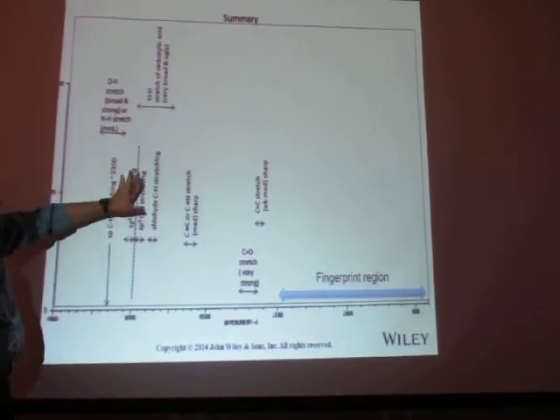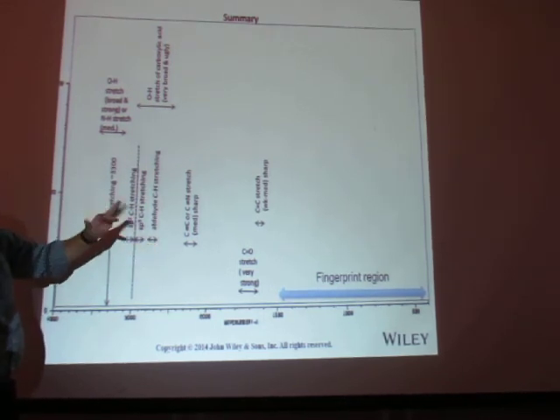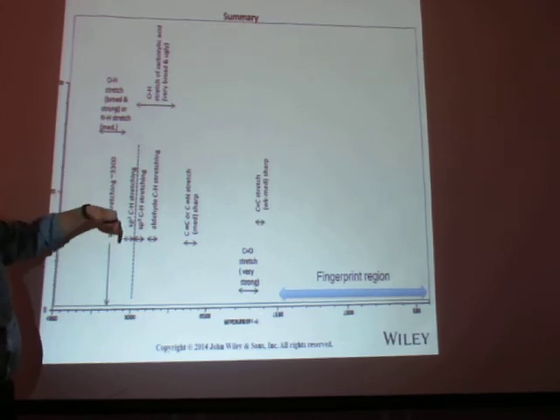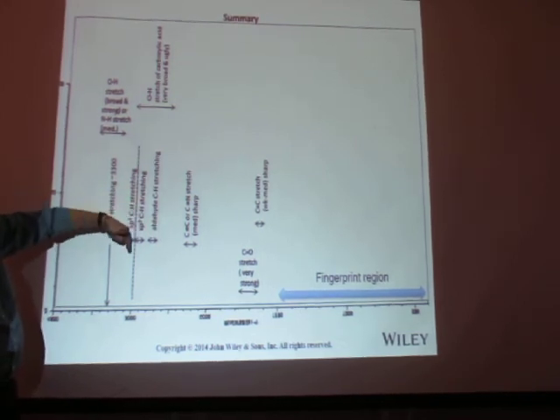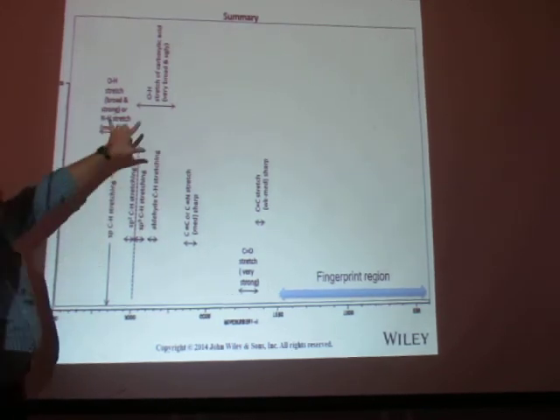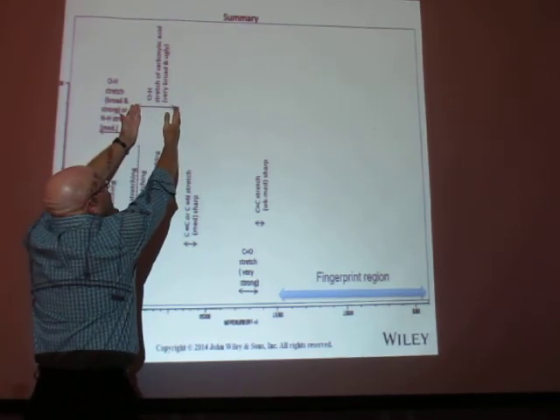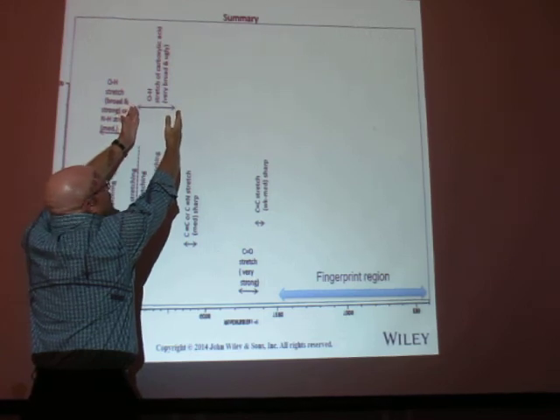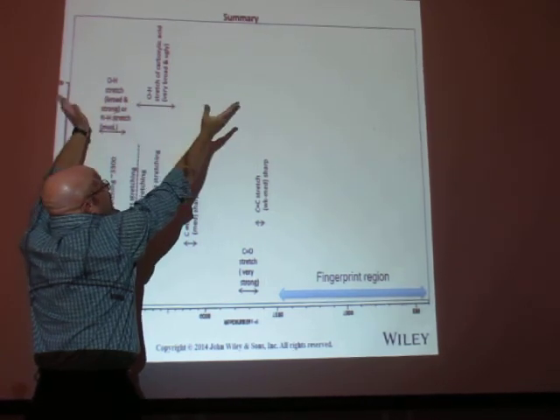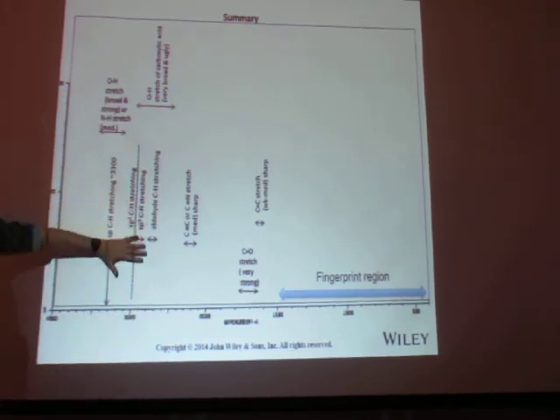Now, other things that we can pick out, you should be able to pick out the aldehyde CH stretch. That was somewhere around 2,800, so it's lower than the sp3 CH stretching. It's going to be down here a little bit lower. It's easy to pick that out. We had the OH of the carboxylic acid. It got lowered because of the resonance, and it's extremely broad, very, very broad, because it's got stronger hydrogen bonding. And again, I called it ugly because it's overlapping with some of these other peaks, so it's not a pretty smooth curve.